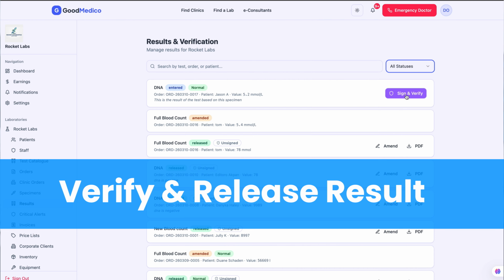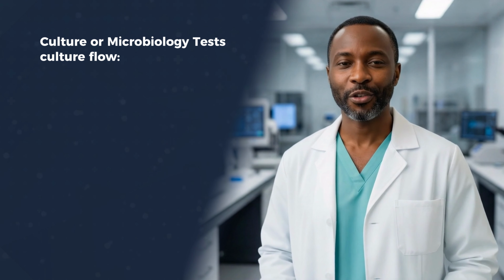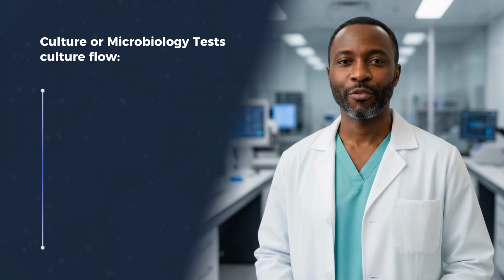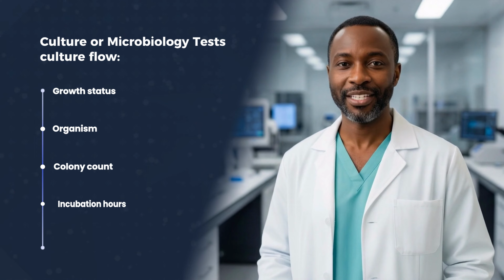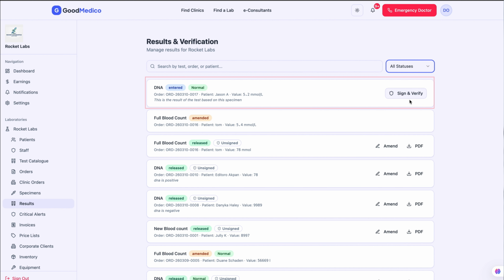We'll verify and release the result of the test. But before we do that, something you need to keep in mind is that for culture or microbiology tests, there's a separate culture flow for it. It goes from growth status, organism, colony count, incubation hours, and antibiogram. Let's now verify this result.